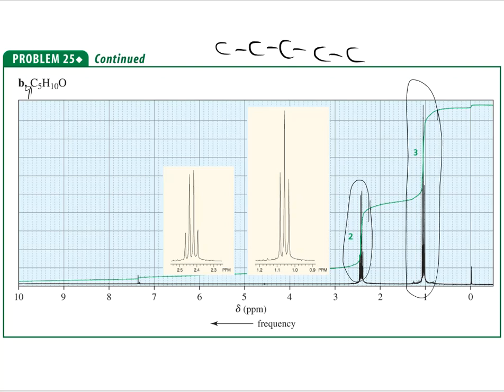So with these 5 carbons, I know that only 2 signals are coming from this, which means I'm going to have double ups on these shifts. So I'm going to go smack dab in the middle here. And this has an oxygen that's present. All right, so I'm going to draw an oxygen here. Now, I've got some choices. What I've got here is possibly an OH, because there's hydrogens there. But I also possibly have a double bond O group that could be there, because that's very common as well. This thing could be an alcohol, or it could also be some type of carbonyl compound.